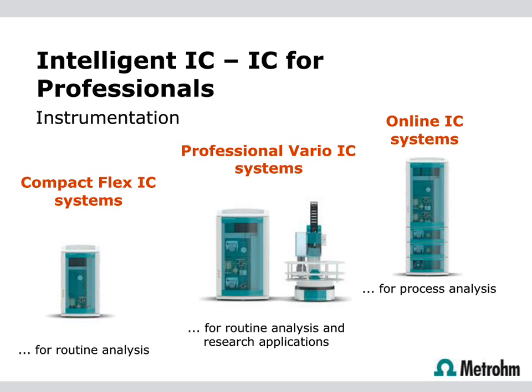Again, one of the big market trends at the moment is looking towards online type analysis. This will, of course, give great real-time feedback for analyzing processes. Of course, if something's truly online, the way you handle the sample preparation is absolutely critical in order to keep the system running and functioning as you want it to.